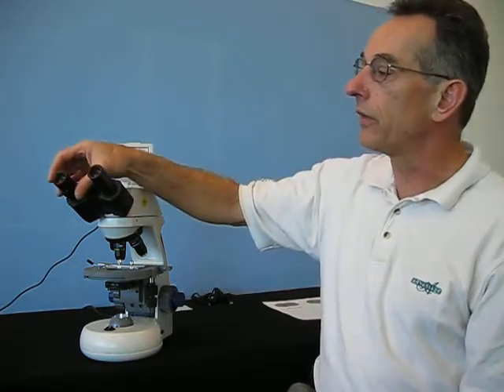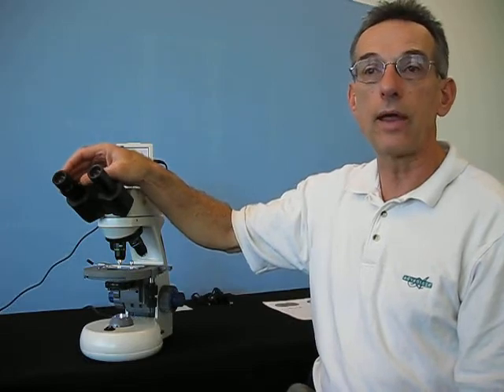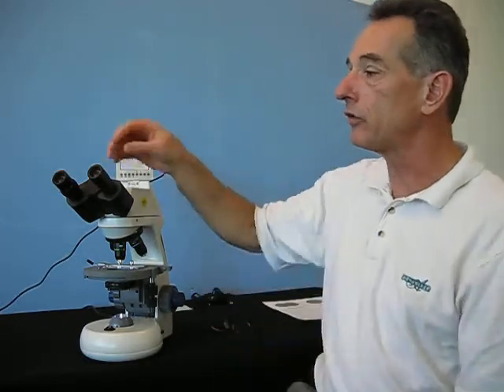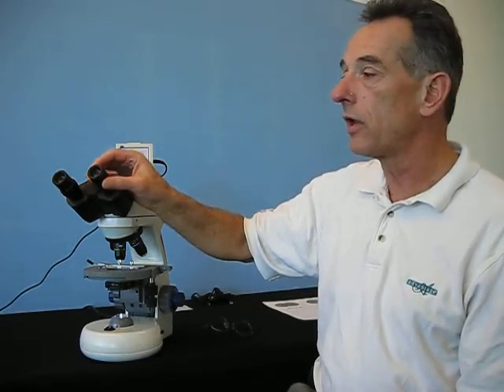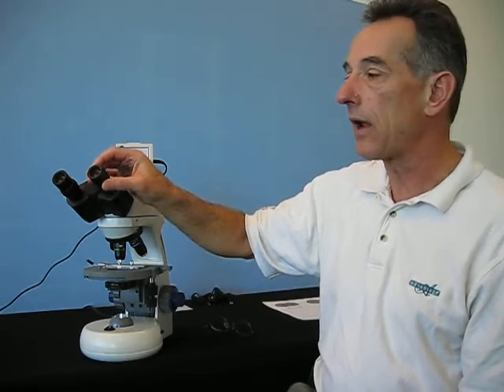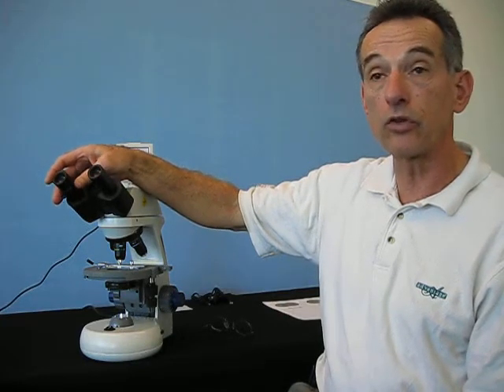Also, on the left eye tube there is a diopter adjustment. Some of you have glasses, and if you prefer to take your glasses off and look into the eye tubes without them, the best way to get a precise image for both eyes is to focus the right eye to the right eye tube and then use the diopter adjustment to bring the left eye tube into very crisp focus at the same time.